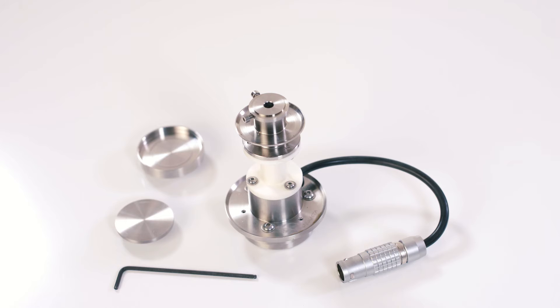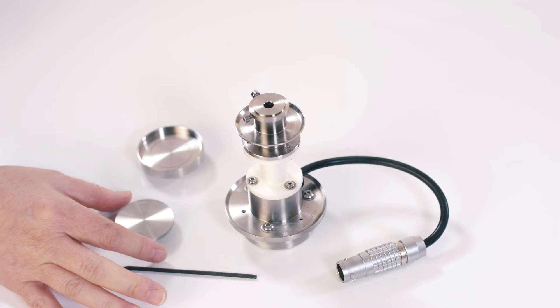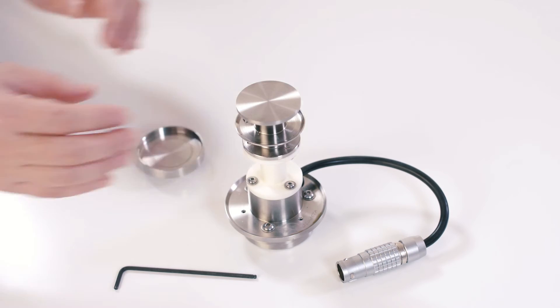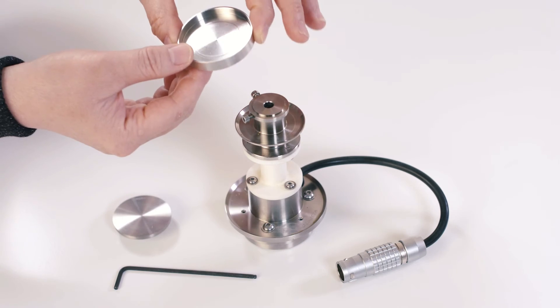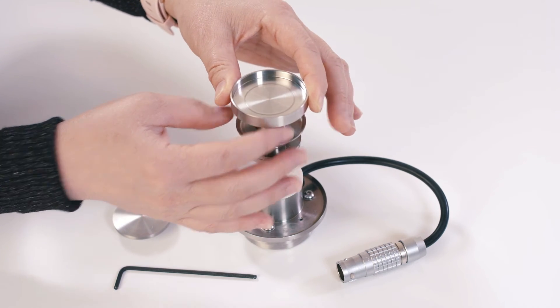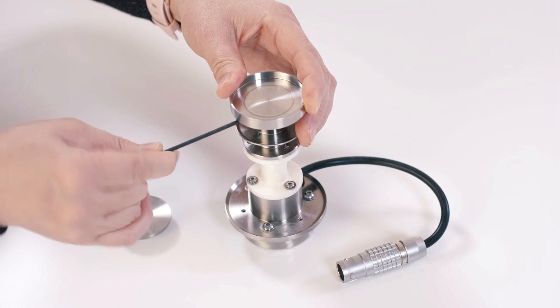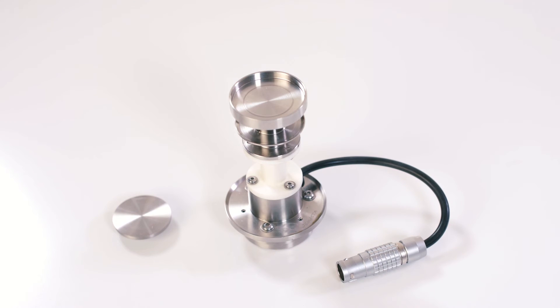If you are using the ETC as temperature control for your triboreometry test, attach your 40 mm disposable plate or this 45 mm stainless steel cup to the ETC disposable bottom stage. Tighten the screws on the side and then install this stage to the bottom of the rheometer.